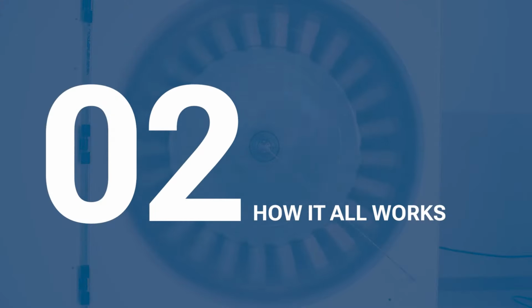In the ascendant-descendant extraction step, separation of the injected sample begins. The peaks on the graph show the switching of the two modes, ascendant and descendant, at specific intervals. The injected sample is passed between the modes, so the components in the injected material start to separate from each other, which increases selectivity. Finally, in extrusion, the components can be extruded from the column as they have been separated from each other. In the graph, you can see how compounds A and B are fully separated from each other.